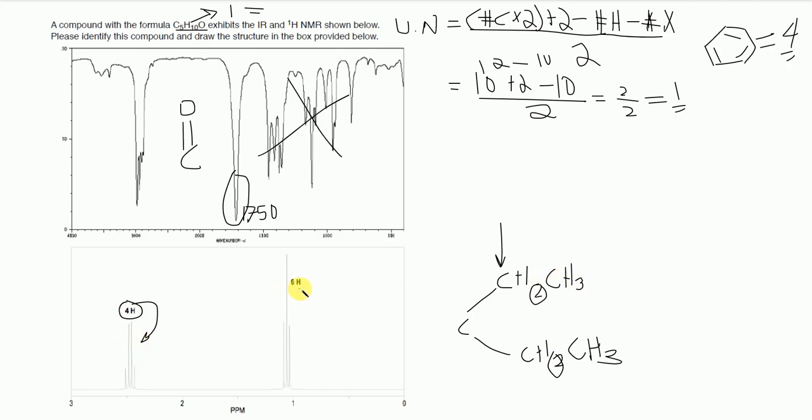All right, and then if I look over here, I have 6 hydrogens that correspond to this peak. So a total of 6 hydrogens, 3, that's 6, and they correspond to 1, 2, 3 minus 1, that's 2. So both of them have a CH2 next to them. So CH2, CH2. And so now we have that symmetry, and it makes a lot of sense now. And now we're missing something, right? So I have 5 carbons.